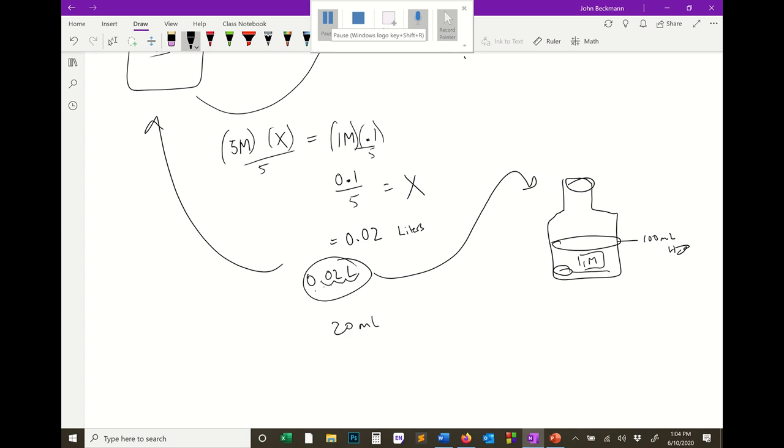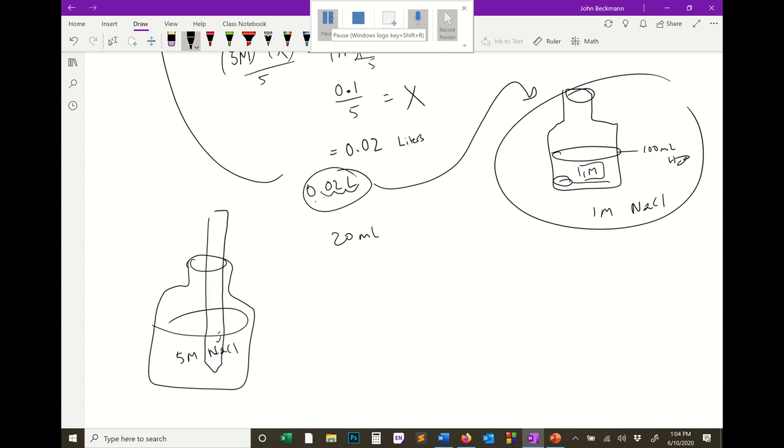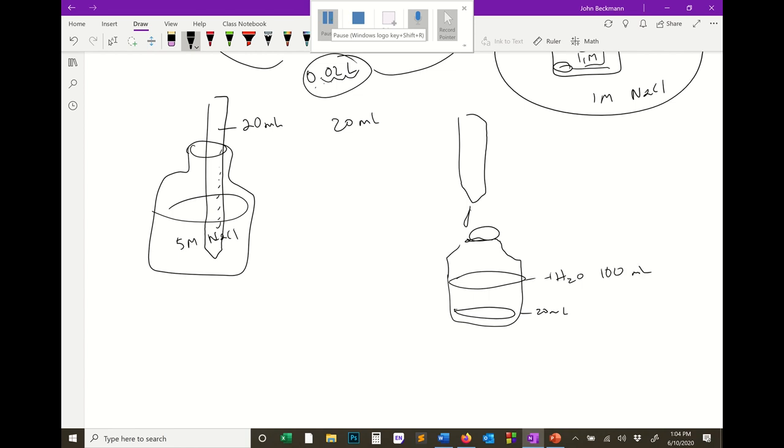That's 20 milliliters. Okay, so the way that we would actually make this solution of 1 molar NaCl is we would go to our stock solution, which was 5 molar NaCl, and we would use a pipette to draw up 20 milliliters, and we would take that pipette and squirt it out into a new tube. So there'd be 20 milliliters in there. And then we would fill it with water to 100 milliliters. And that will be our final solution of 1 molar sodium chloride.